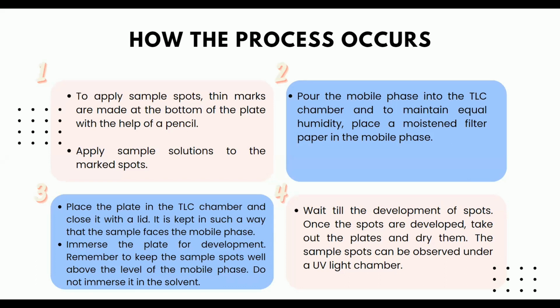4. Wait till the development of spots. Once the spots are developed, take out the plates and dry them. The sample spots can be observed under a UV light chamber.